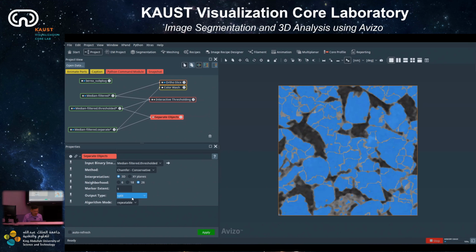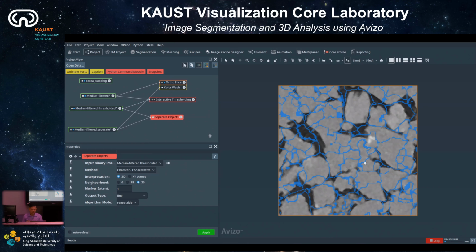But if you go to line, the split is based on the slice that you created from the watershed segmentation algorithm. Now they have the basins, what we call watershed segmentation basins, and you can see how the basins are defined on the objects.